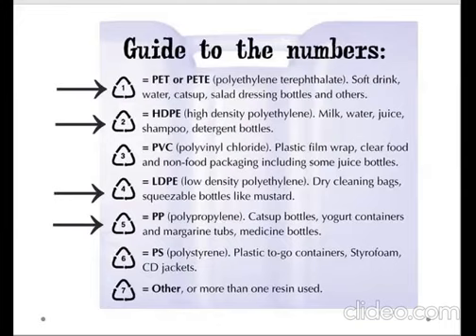So I believe from this statement that hindi friendly si plastic. Hindi siya friendly to the environment, hindi din siya ganun ka friendly sa tao. Okay? So, I guess ganun yung property ng plastic because synthetic kasi siya. Hindi siya natural. Okay? So now let us proceed with the different types of resins or plastics.